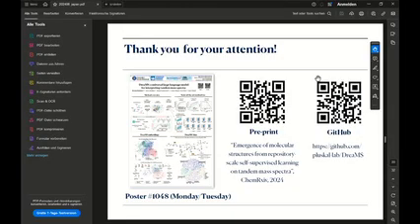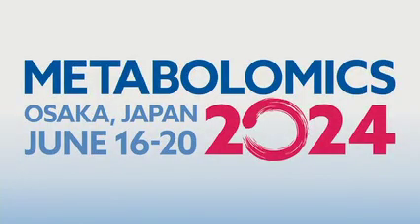Thank you, Roman. And Louis, are you ready? I want to highlight that Roman is doing some great work with machine learning, and the PyTorch model that he's been developing is out there, so you can use it directly. Also in MZmine, we can now very easily integrate it, because there's a very nice library where we can just integrate any PyTorch, also TensorFlow model in MZmine. So if you're working on something, that might be a great way of getting this out there, not only developing the model, but then also serving it to a wider community.